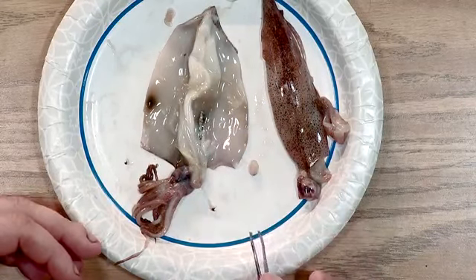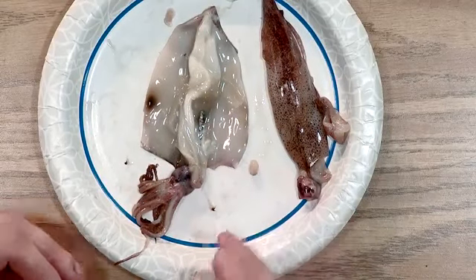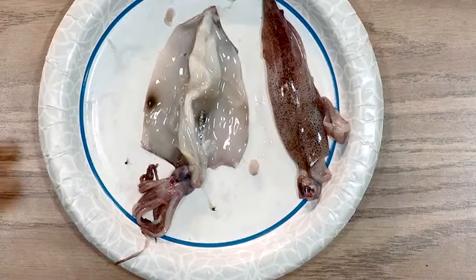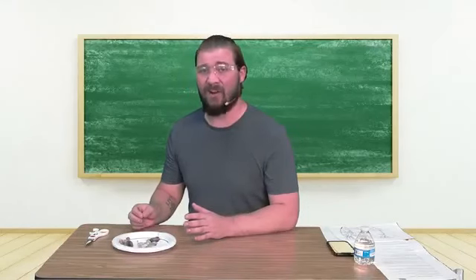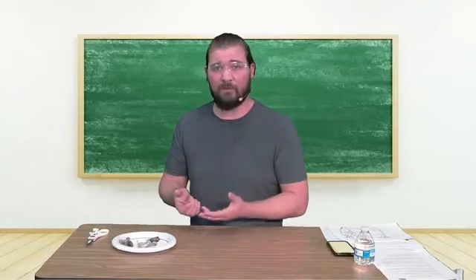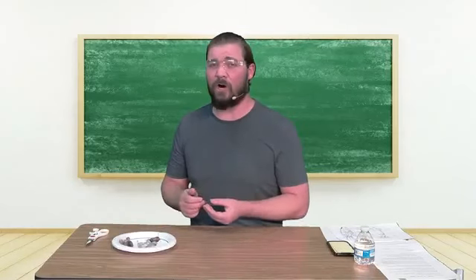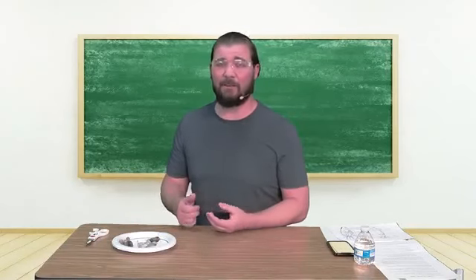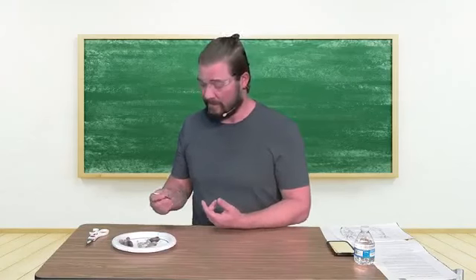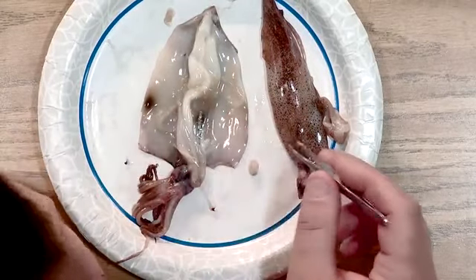Now, if I'm not gentle when I first get into this, I can puncture or rupture it, and there will be ink all over inside here, which will make a lot of your task very difficult. So when you're feeling it around and getting comfortable with it, be wary that if you squeeze it too hard or really jab in there with your scissors, you could damage some of what we're trying to look at.